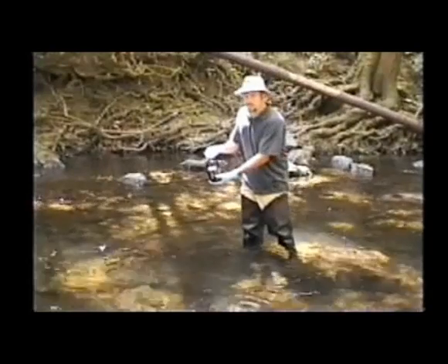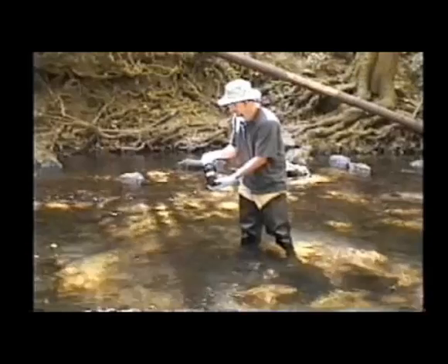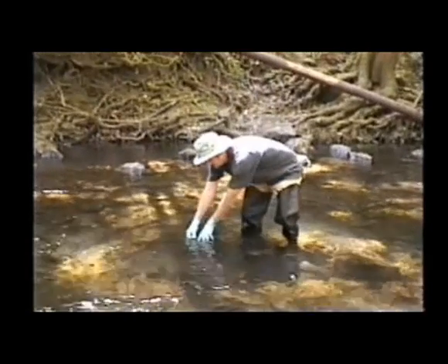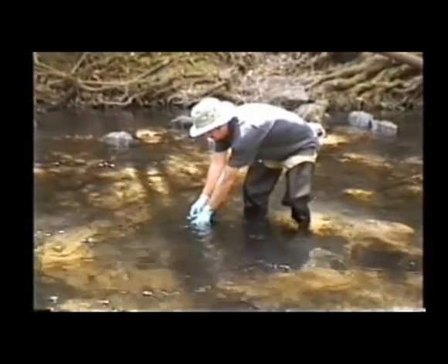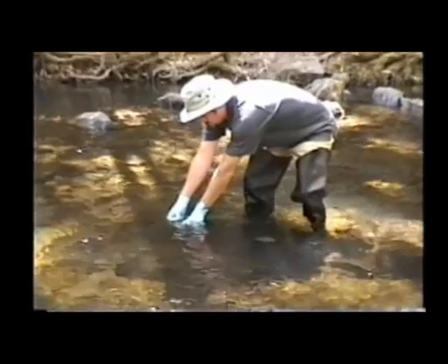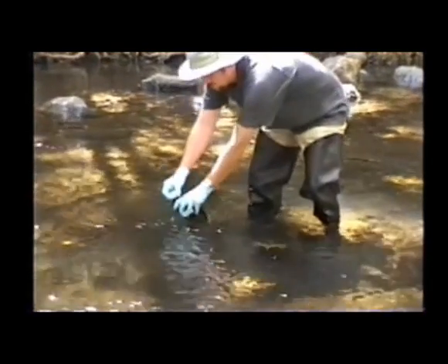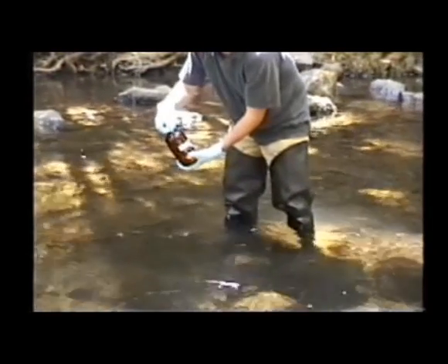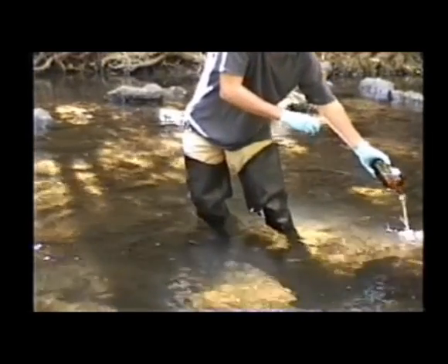Sean is now going to demonstrate the collection of an organic sample. He's using a 1-liter glass amber bottle. This bottle does not contain preservatives, and it will be rinsed 3 times with ambient water. So he will put the bottle under water, uncork it, allow it to partially fill, remove the bottle, agitate it, and then dispose of the rinsate water downstream and behind him.